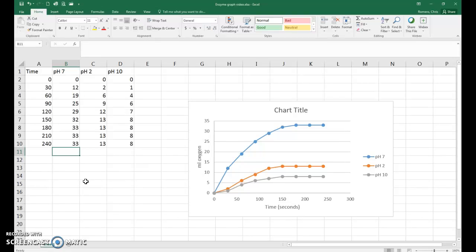Rates, remember mathematically, are the same as the slope of the line. So we'll go through Excel to show you how to calculate that.